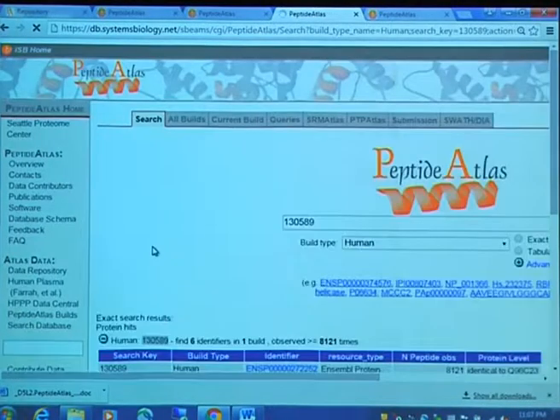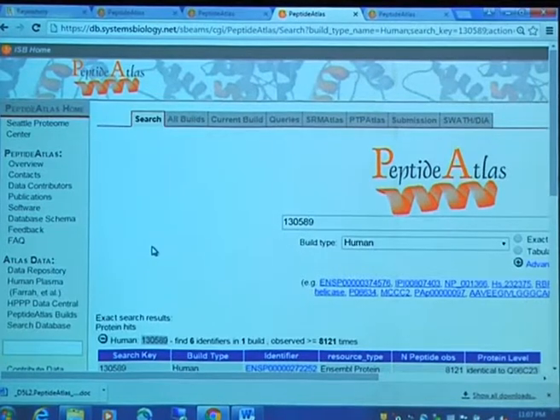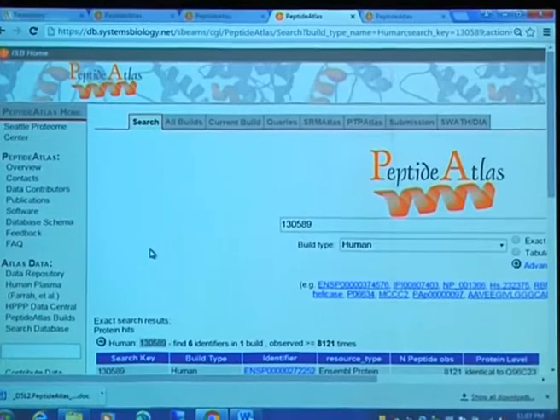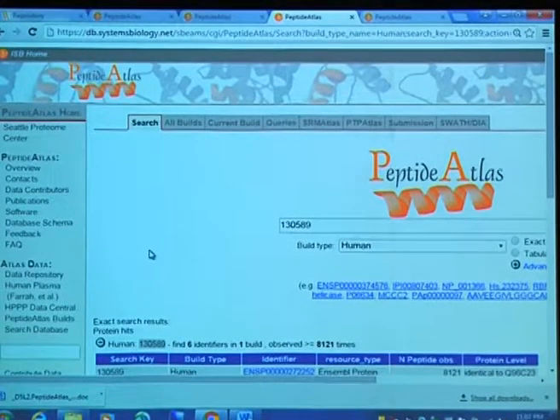So it's taking us back to the search page. For an individual page, you already sort of know which accession you're looking for. But the search page actually understands all the accessions. So any accession that we use, you can look for it here. You can see that we've seen this quite a few times. More and more, we like to use the SwissProt/UniProt accession. So I'll go ahead and use this one.